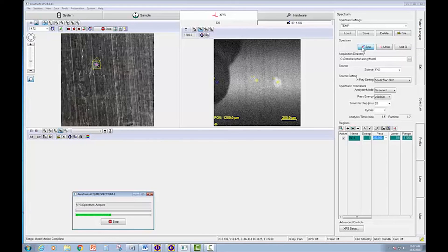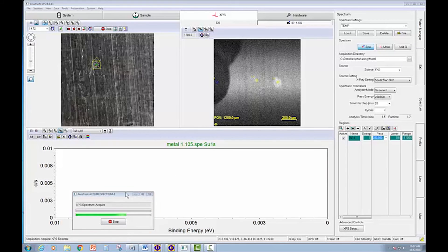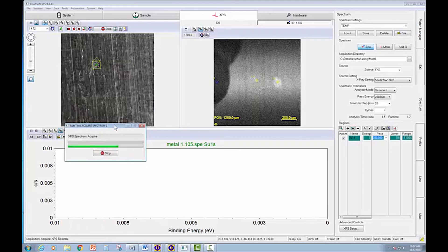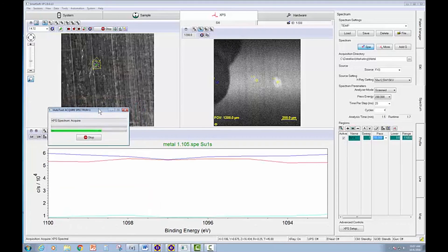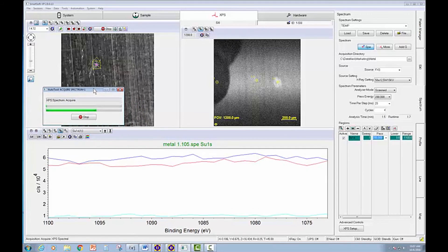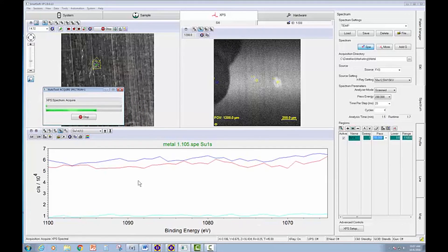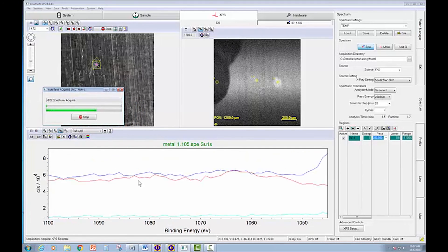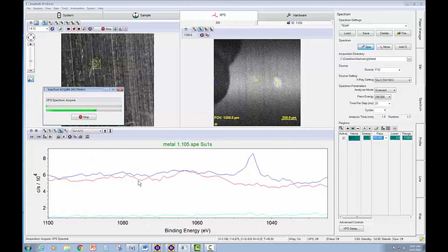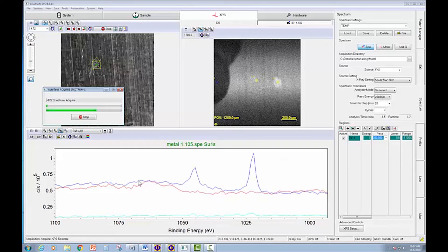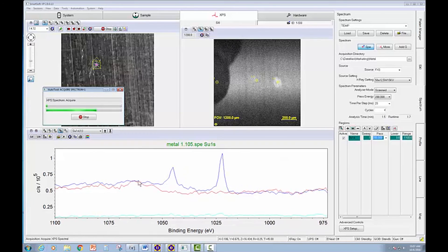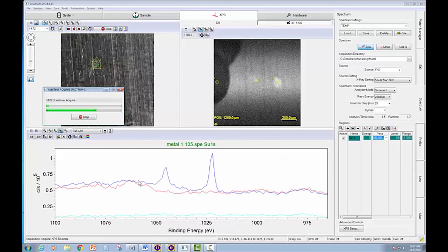So you can see the X-ray setting loading and the acquisition beginning. And we'll have a look at our spectra. You can see the three areas already are quite a bit different.